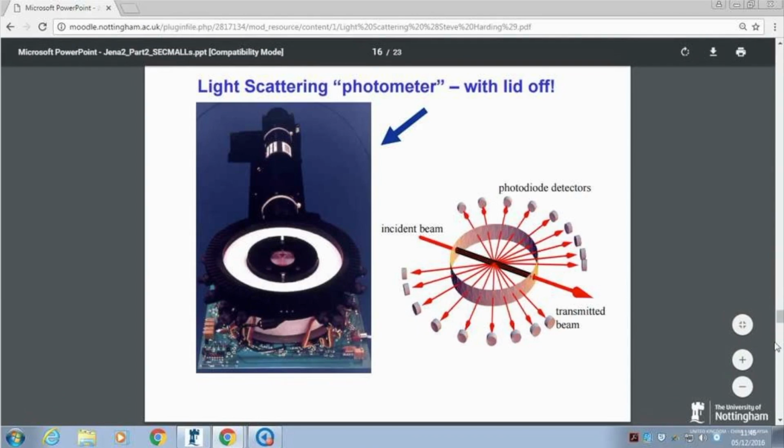So it's great. The columns separate, and the light scattering instrument measures the molecular weight. And it's a great combination because light scattering by itself is not very good at handling mixtures of molecules. So polysaccharides, which got all sorts of stuff in there, mixtures of protein, dimers and trimers, all this sort of stuff.